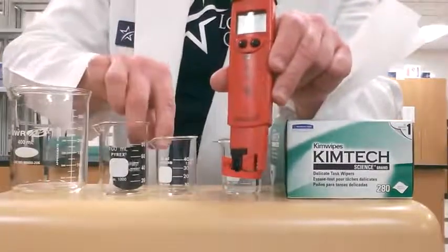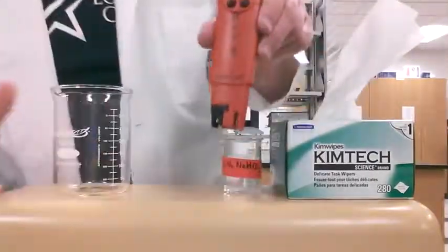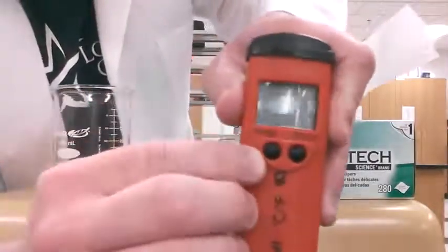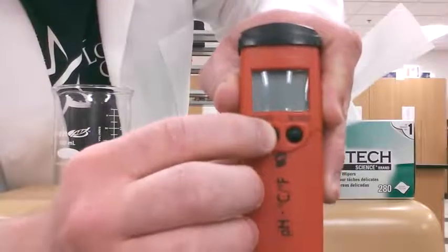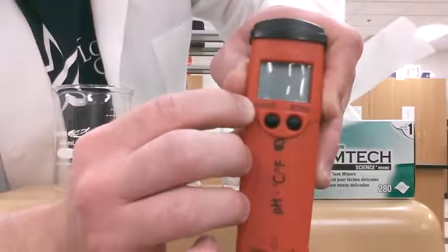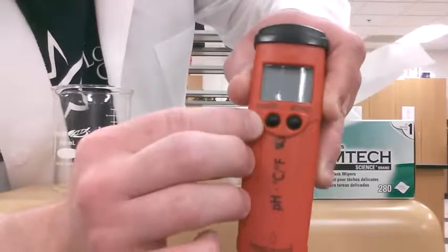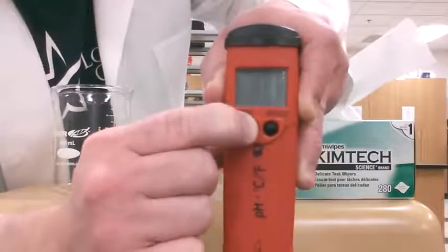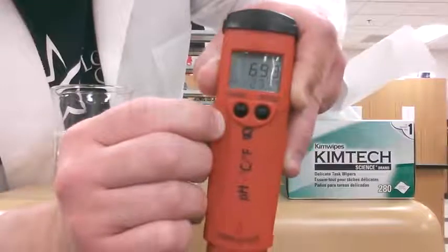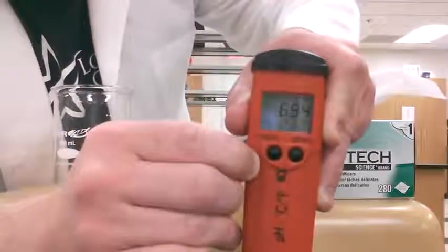Once we set that aside, we're ready to go. We're going to turn on the pH meter by holding down the power button — it has a circle with a small line through it, which most power buttons usually have, and the word 'mode' next to it. We're going to hold that button down for a full second.